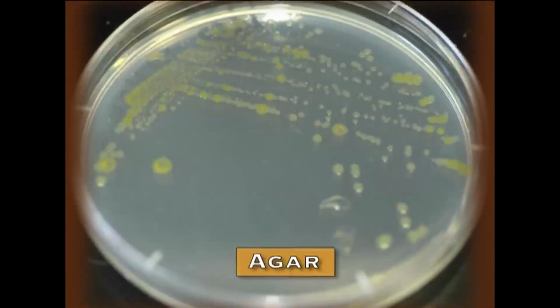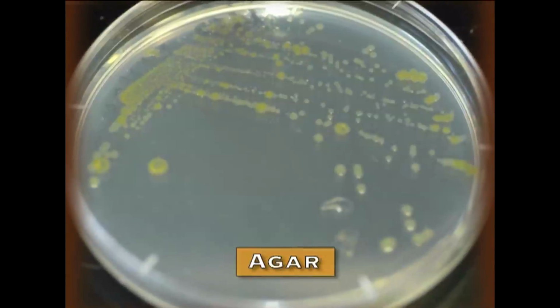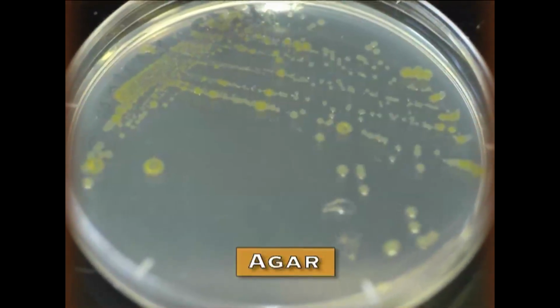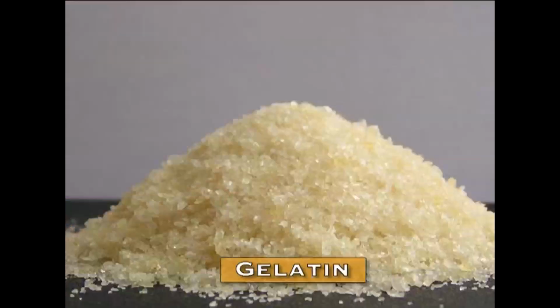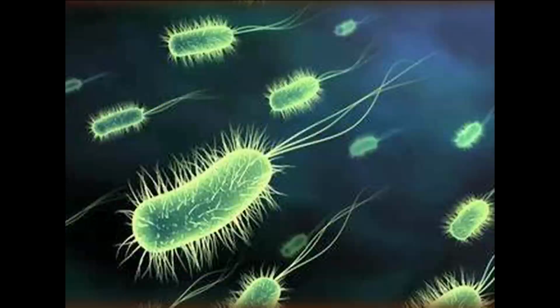The agar which is added to the culture medium to provide a solid support for the growth of microbes is generally added to the bacteriological medium at a concentration of 1.5 to 2%. Now, why was agar preferred over gelatin? Because it is relatively inert to the microbes, and the microbes are unable to break down the structures of agar and agarose, and thus it remains solid.